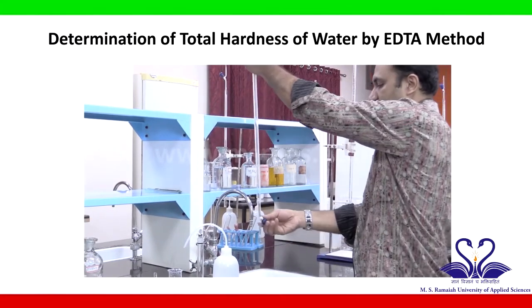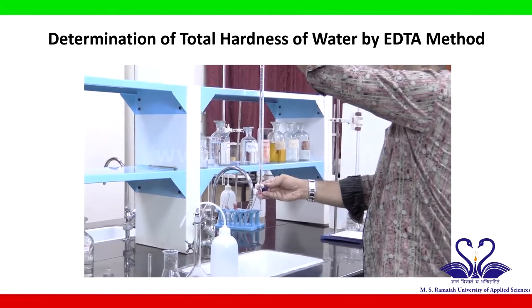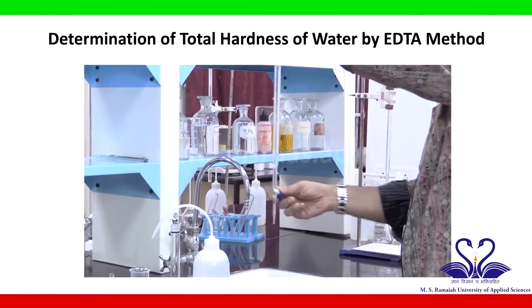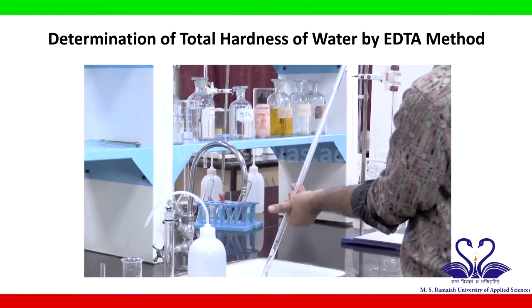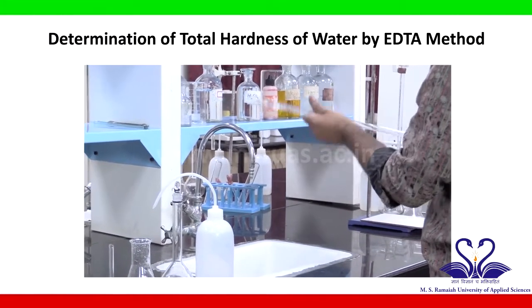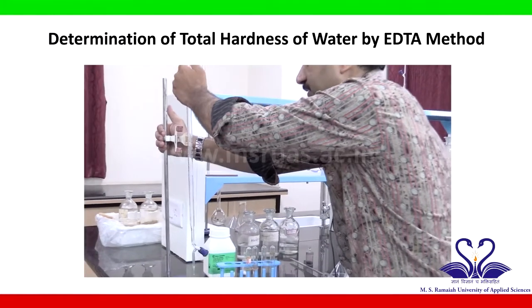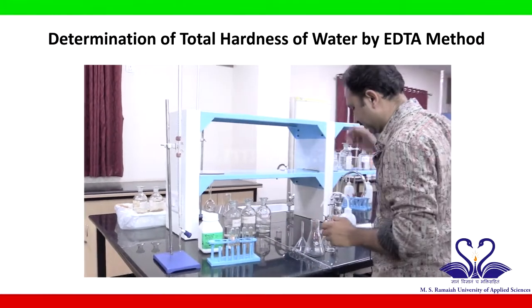You have to open it from both the sides. So it has been washed with water and distilled water.